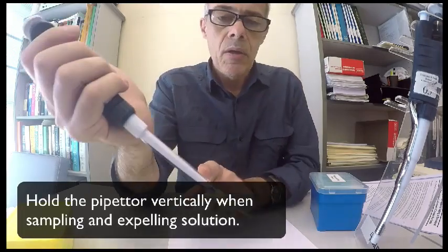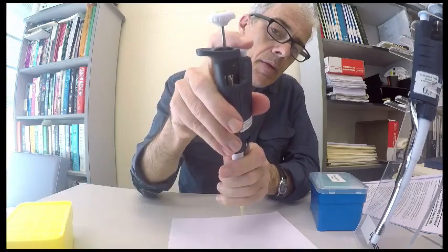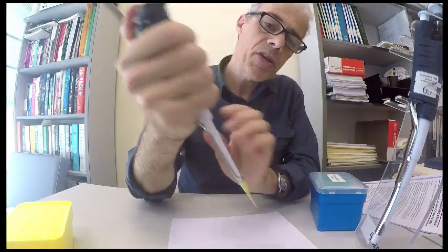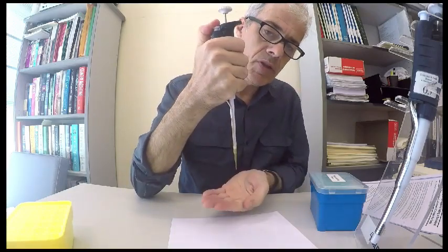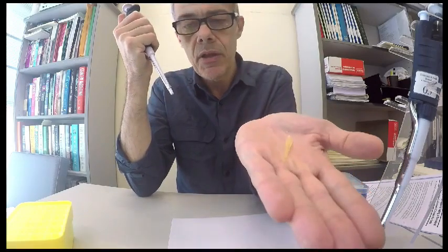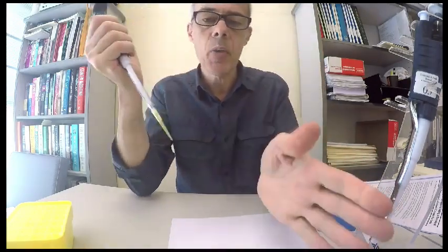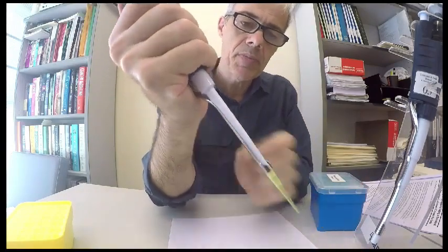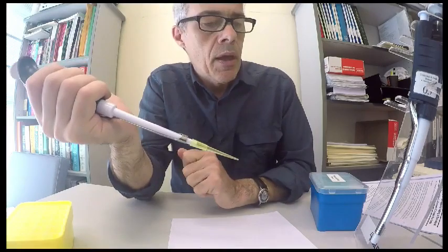Okay, to remove the tip, there's a button here. If you just put a bit of pressure down on it with your finger, it will just pop the tip off. Okay, so there we go. So normally you'd have a waste bin, and you would just dispense your tip into the waste bin. All right.